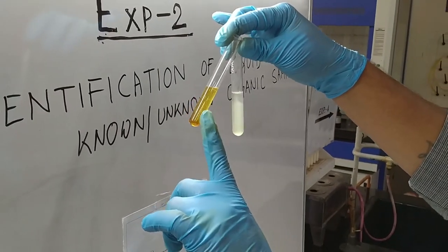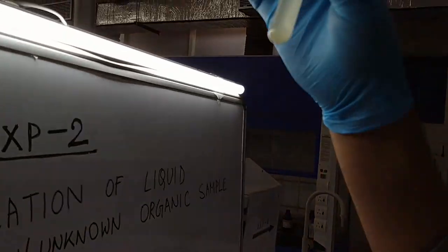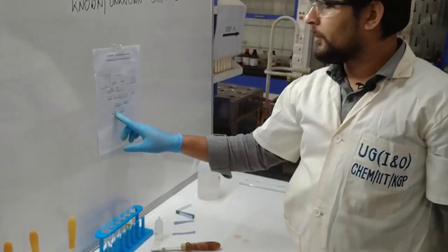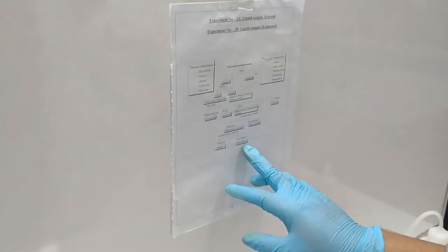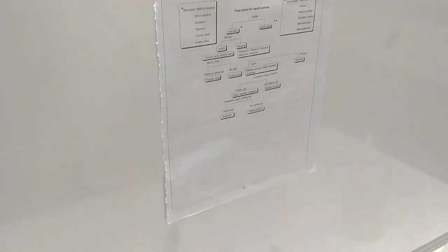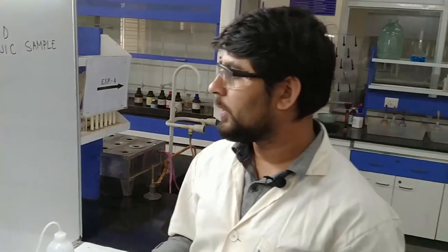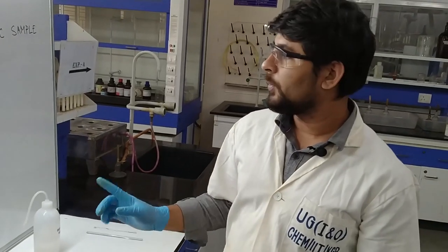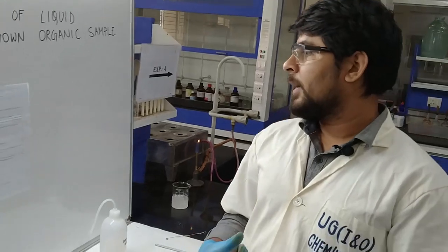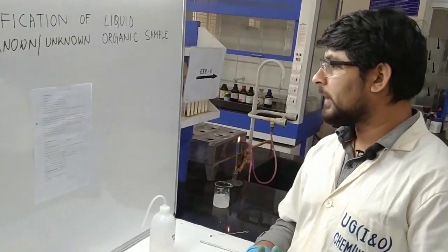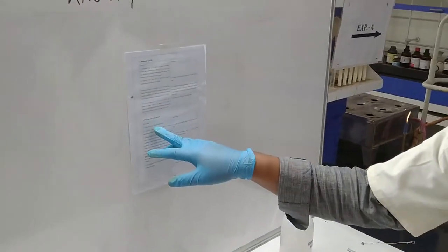You can see the difference — this one is the positive observation and this one is the negative. This one is for NaOH and this one is for NH4OH. You can see something is settled down at the bottom of the test tube for the NaOH test. According to the flow chart, we got no yellow precipitate in NH4OH, which indicates ethyl alcohol. So these are our preliminary tests — all the preliminary tests are completed. Now we have to perform the confirmatory test for ethanol. The first confirmatory test is the oxidation test.